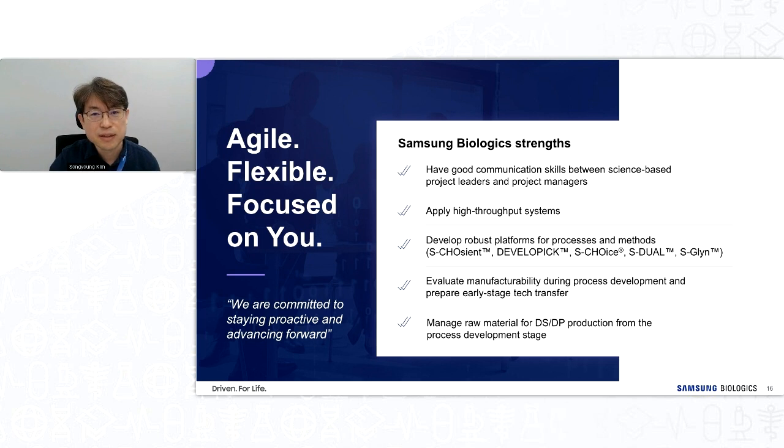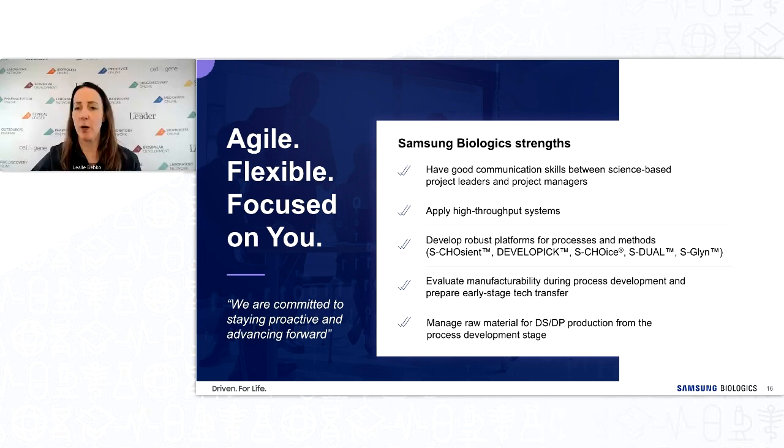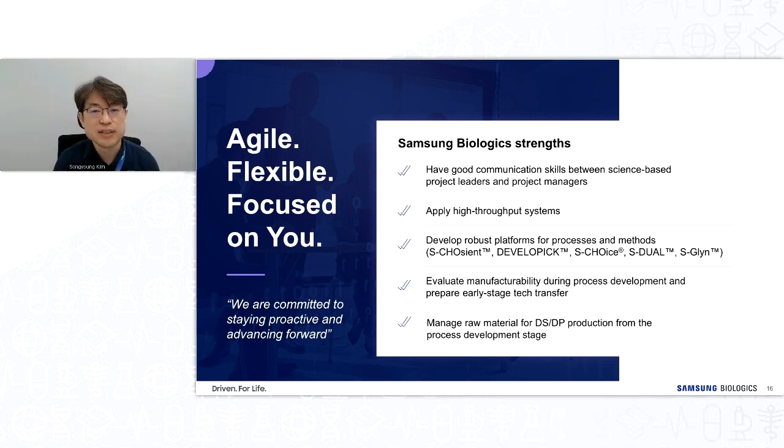What is some of the equipment that Samsung DSP possesses for resin screening or column process development? We have ÄKTA Avant and are currently developing equipment with small columns to accelerate process development.